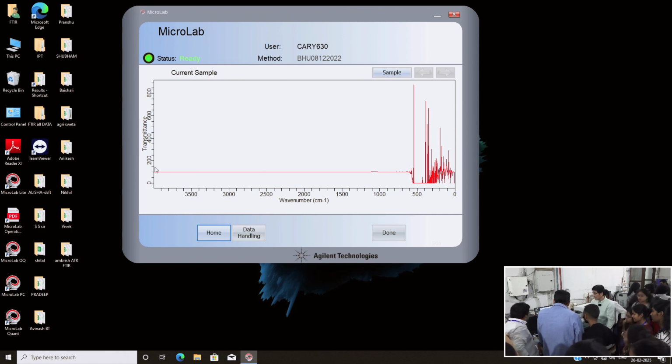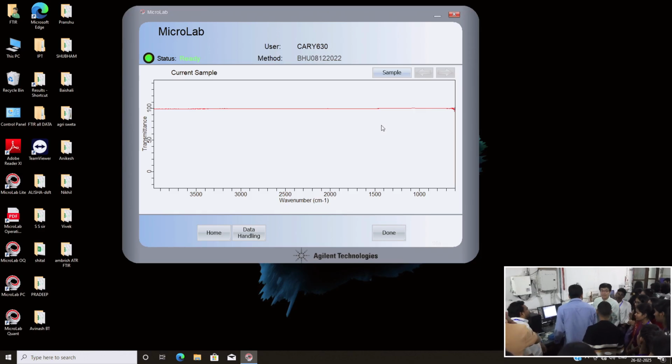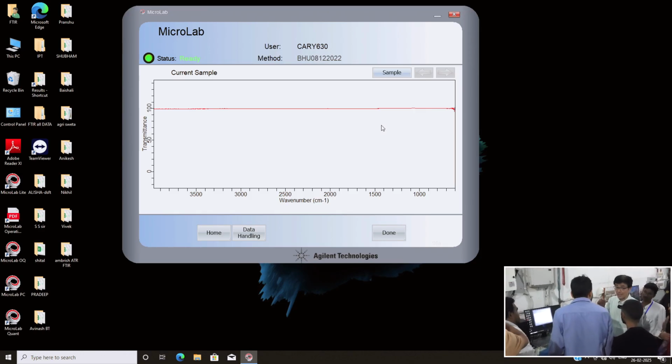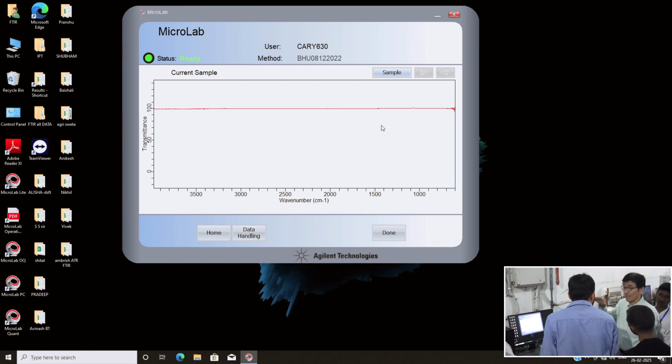So this is a spectrum of what? Yes, water, but you measured I0 with this condition. But this is water, right? So a white band will occur. If I0 is air and I is water, then we will find the water signal. If I0 is water and I is water, then it is always the same, 1.0.